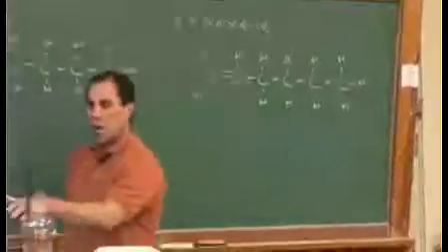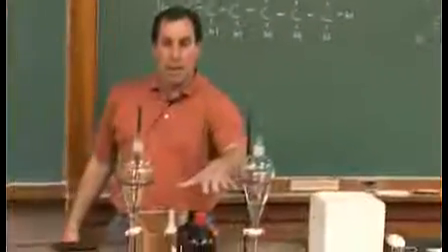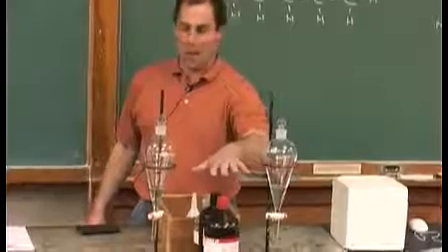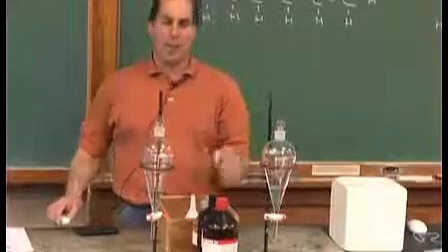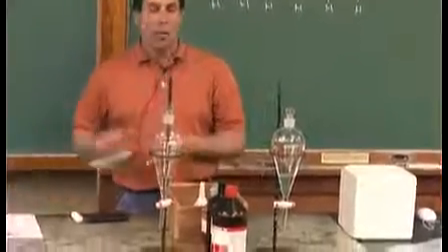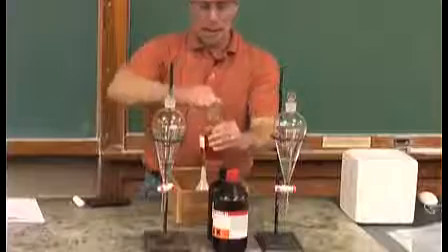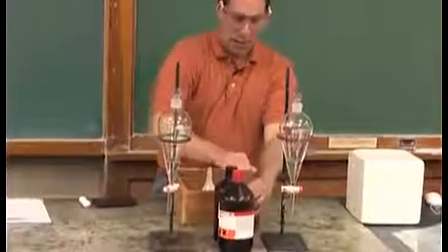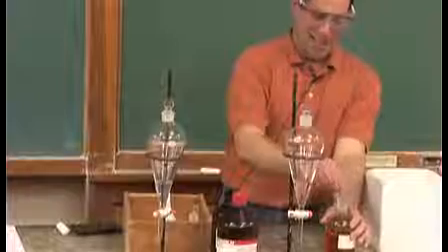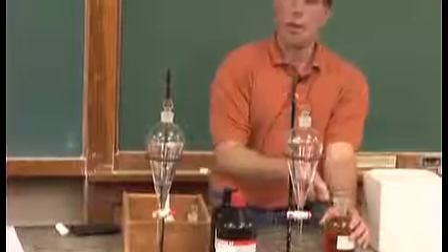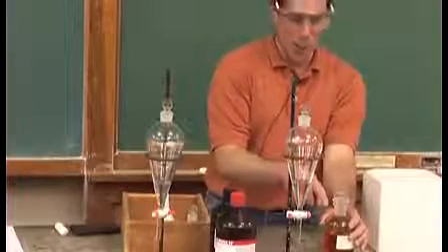So back to the separatory funnels. One contains the double bonded 1-hexene, and the other one has all single bonds. I'll play the little game of I forgot which one is which. Well, let me go ahead and find out which one's which. I'm going to pour some bromine water. There's a little bit of bromine and quite a bit of water dissolved inside this glass jar.